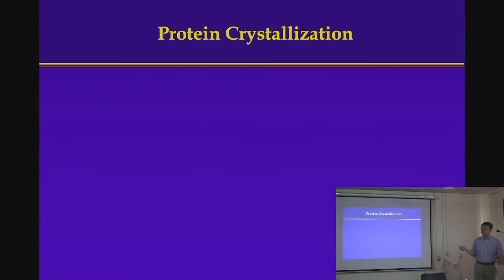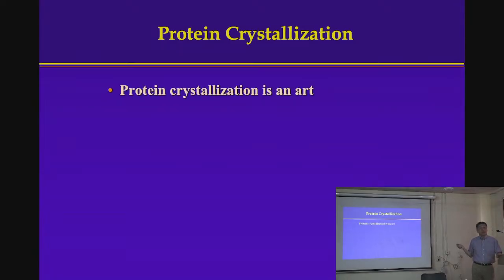So crystallization is an art because we don't have any clue how to grow crystals. Well, how to grow a crystal of a protein of interest. However, doing crystallization is very easy. I assume you have all used pipettors, right? How to use a pipettor? Yes? I hope so. Anyway, if you know how to do that, you can grow crystals. But because it's an art, anybody can do it as well. Some people do the art better, some do it worse. I'm not good at art. I'm okay at growing crystals.